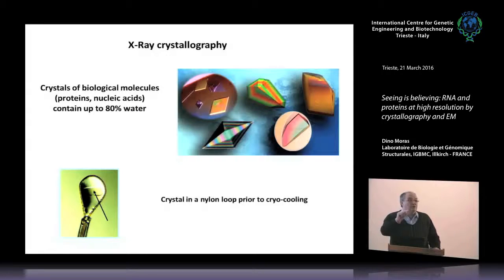What is important in science is the result and also how to get the experimental evidence. So all my point of discussion will be what kind of tools we have now to get the molecular information. What does crystallography do? Just very quickly. Crystallography is based on what you saw before, which was diffraction of not crystals, but elongated fibers. It's fiber diffraction. But the principles are the same. The interpretation of the fiber diffraction was crystallography.